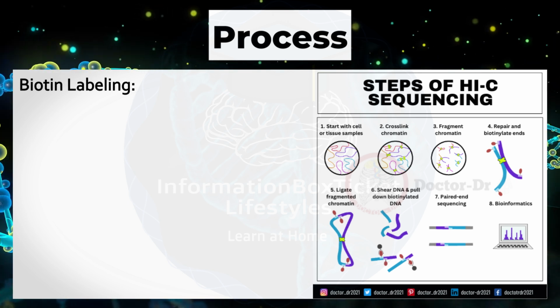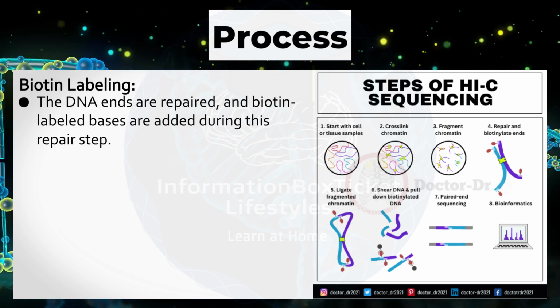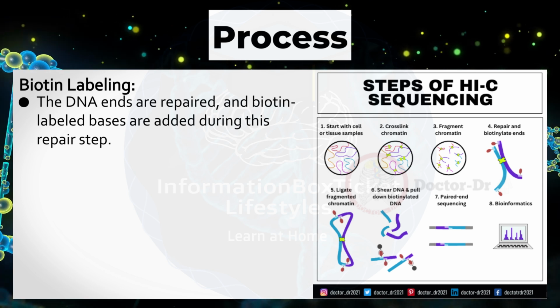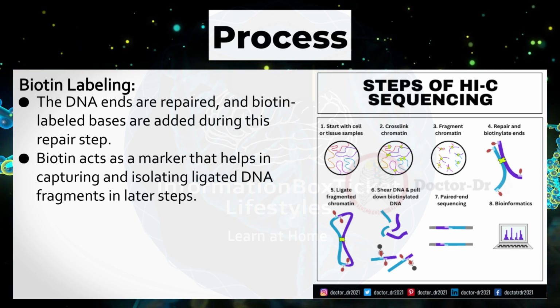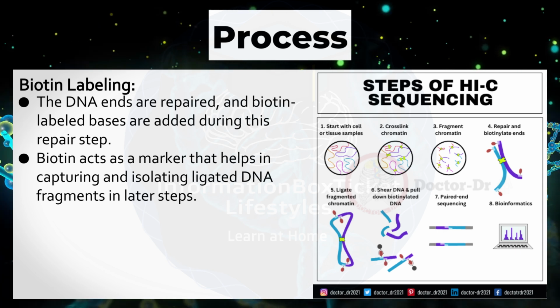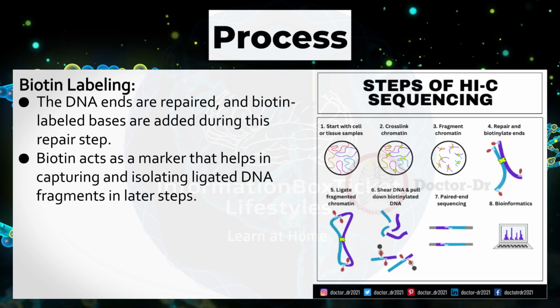Biotin labeling. The DNA ends are repaired, and biotin-labeled bases are added during this repair step. Biotin acts as a marker that helps in capturing and isolating ligated DNA fragments in later steps.